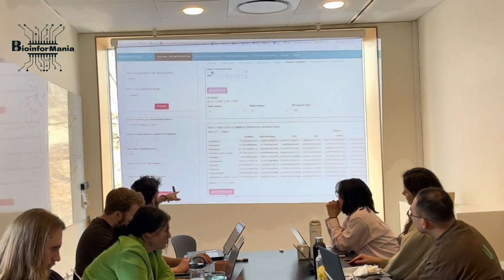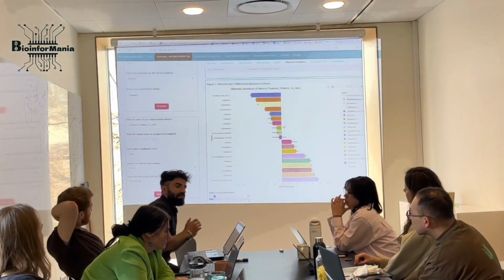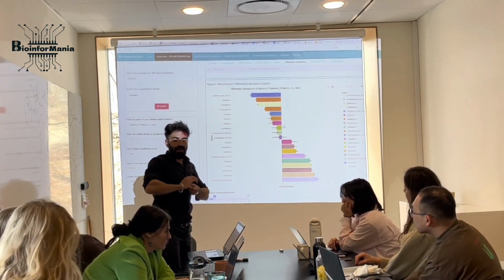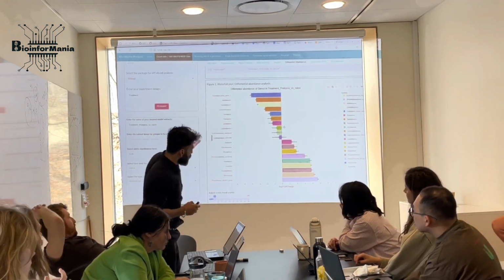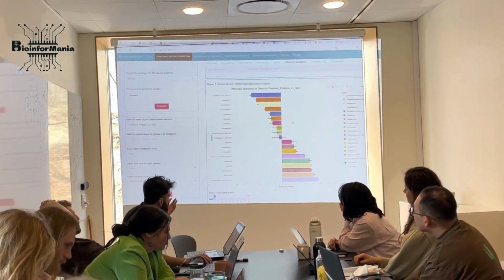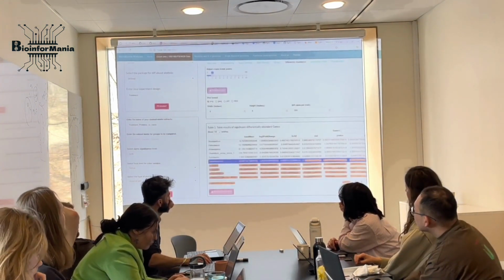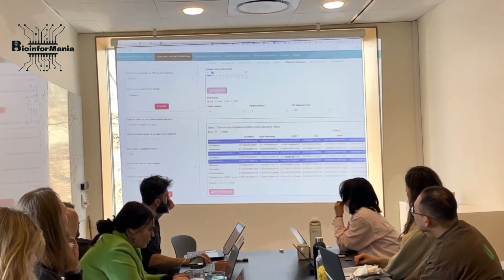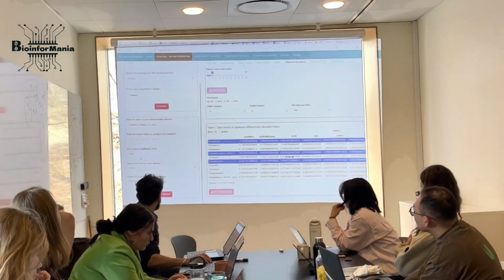Okay, yeah, the cool thing is, whatever you see here is basically significant changes, adjusted for family-wise error, okay? FDR, by Benjamini-Hochberg. So everything you see here is significant. And you can also see in the data here that we are looking for the adjusted p-value. Adjusted p-value is basically significant for this alpha level.